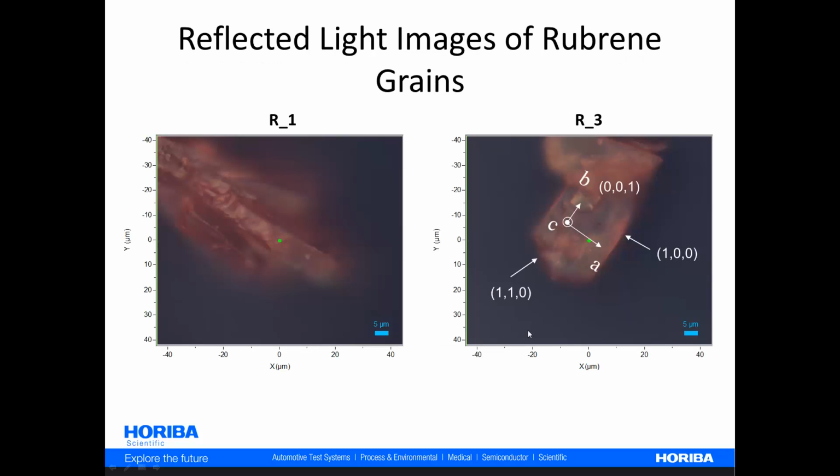And here are 2 reflected light images of Rubrene grains taken right out of the bottle.